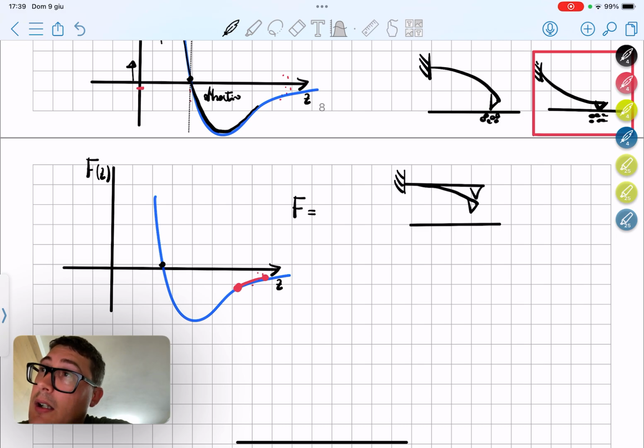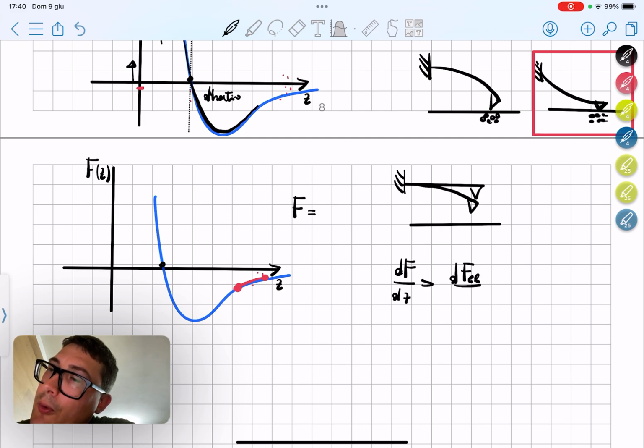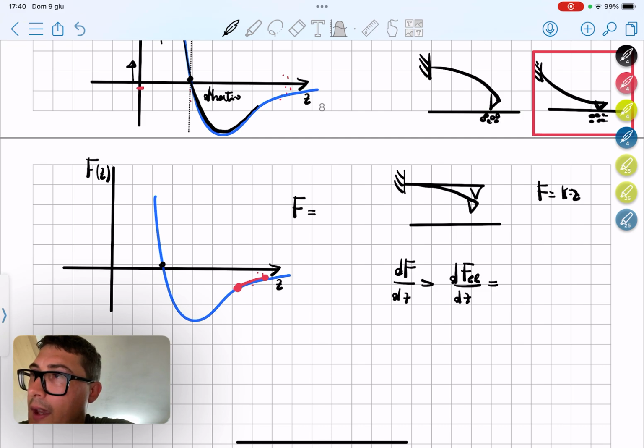The more it's going down, the more it's bending, but at the same time there is this equilibrium. But there is a particular distance at which the gradient of these attractive forces exceeds the gradient of the elastic forces, which, remember, is k, let's say z, and appears to be exactly the spring coefficient.